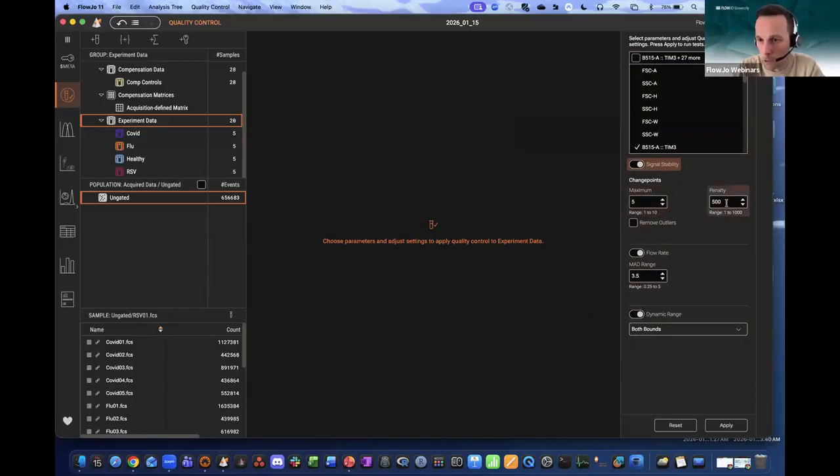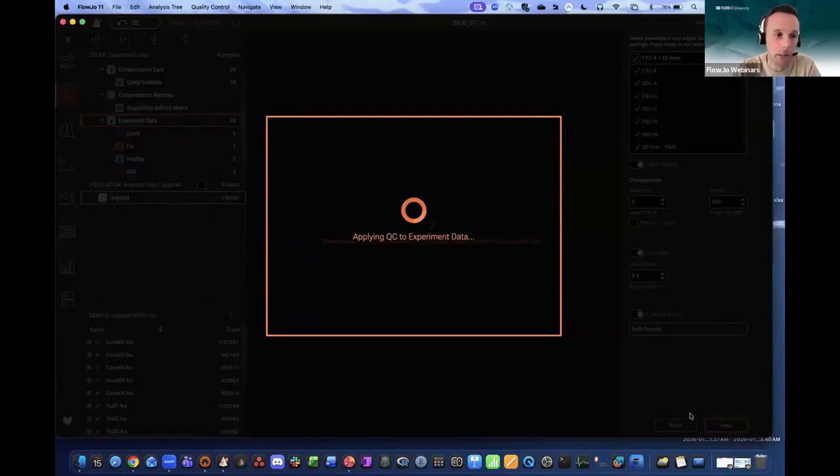If you want, you can adjust the penalty. For example, if you want to be a little bit more strict, maybe 200, if you want to be really strict, or leave it at 500 if you're happy with it. And here, I'm just going to click on apply. You see I have 20 samples between 500,000 and 1,000,000 events, like I did in the live demo. It should take about 15 seconds to run the QC on all those samples.